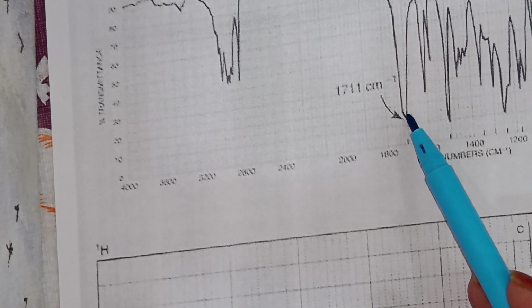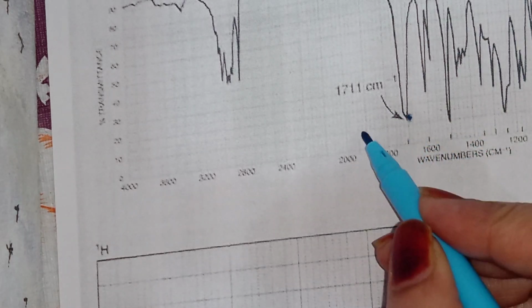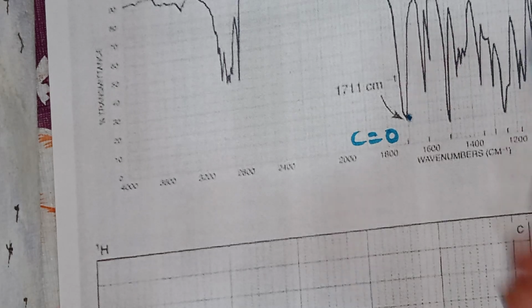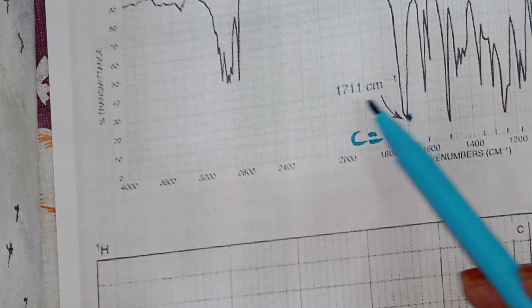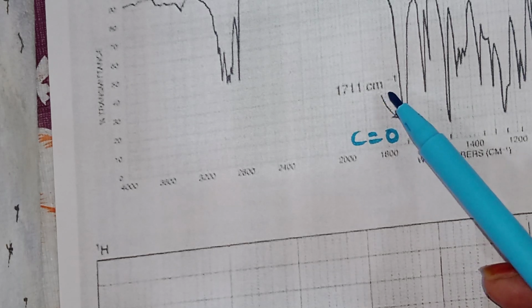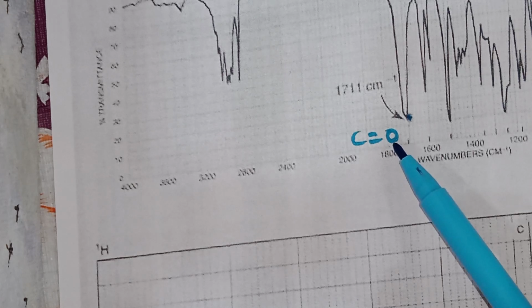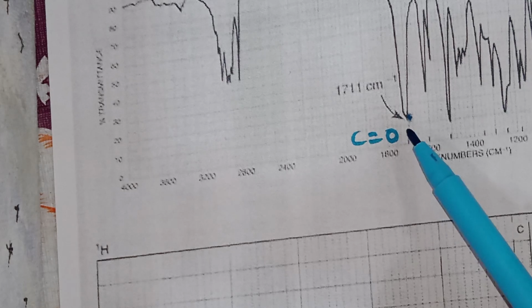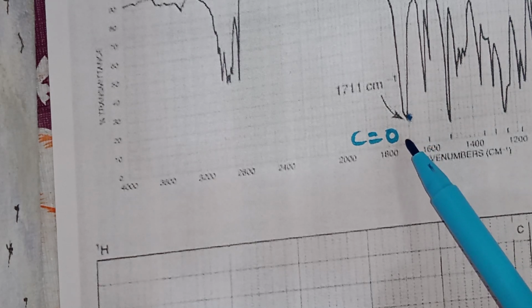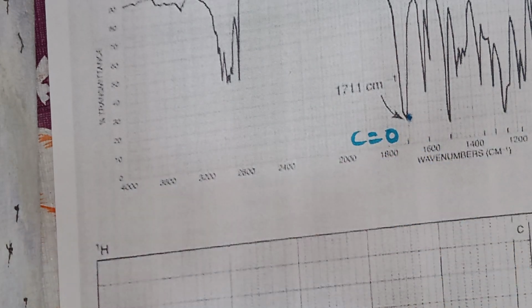is attributed to a C=O group found in the infrared spectrum at 1711 cm⁻¹. This value for the C=O is what we might expect for an unconjugated carbonyl group, but not in an ester since it is very low, instead in a ketone.